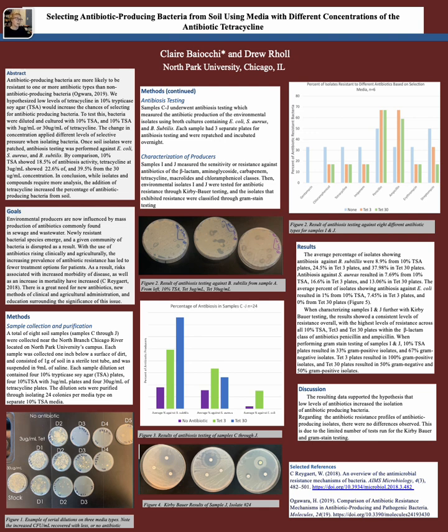And then I did a Kirby-Bauer test with only 6 samples. So this was toward the end of my research. I didn't save all of my other isolates, but what I did find was a diverse amount of antibiotic resistance against gentamicin, chloramphenicol, imipenem, penicillin, ampicillin, erythromycin, and streptomycin, which are all very common antibiotics used in clinic. And the highest was in penicillin and ampicillin, the beta-lactam antibiotics. However, I can't really make any claims because the data was limited and small.